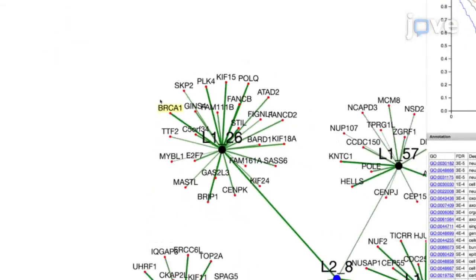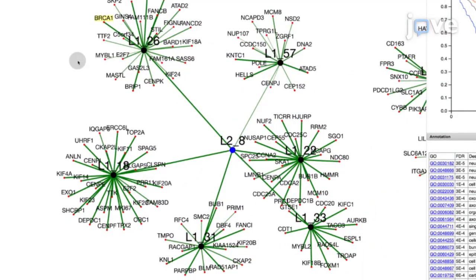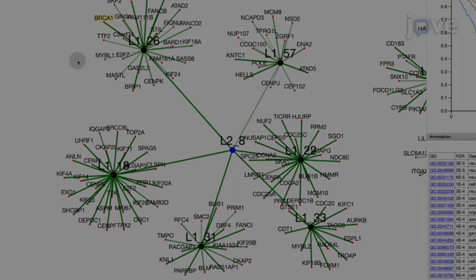Reposition the mouse over the graph display and scroll to zoom out to see the level of the node and its associated factors that are neighbors to the most closely associated gene factor.